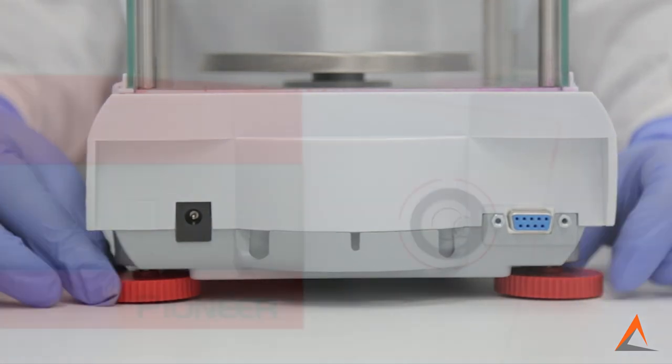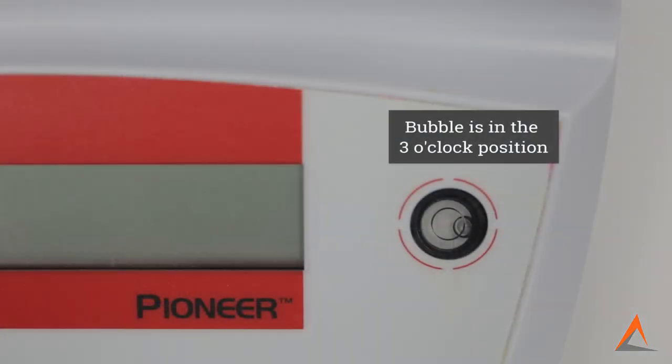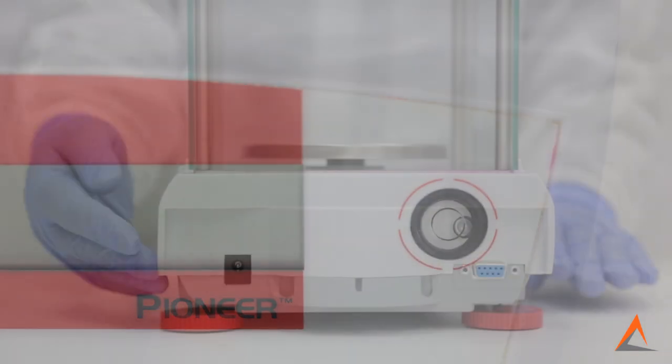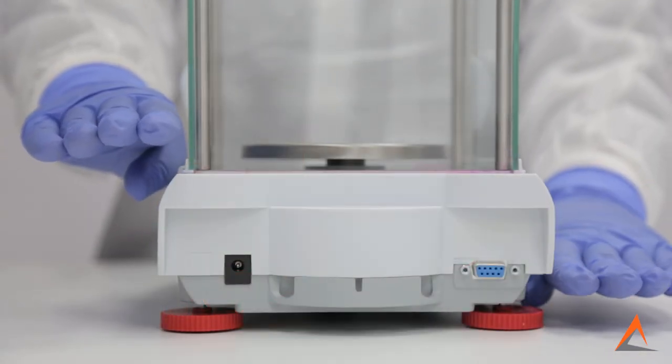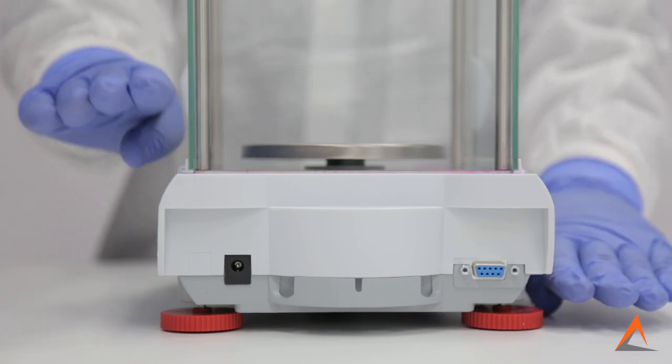Now, if the air bubble is in the three o'clock position, this is indicating the right side of the balance is higher than the left side, meaning the balance is vertically level but not horizontally.